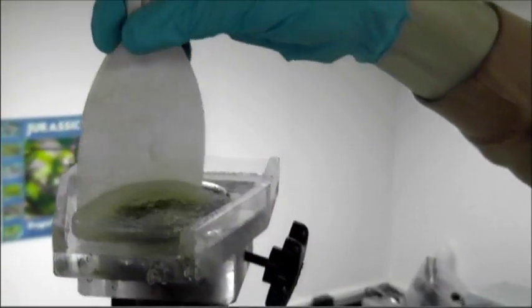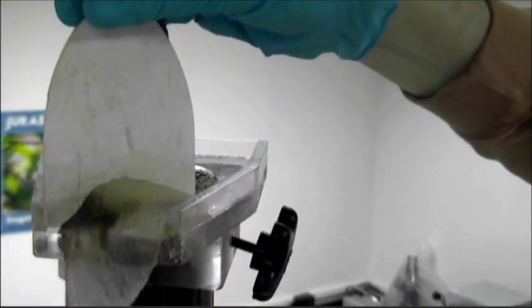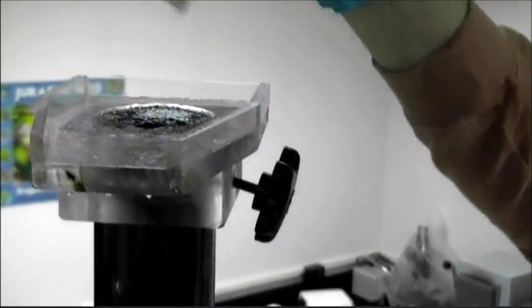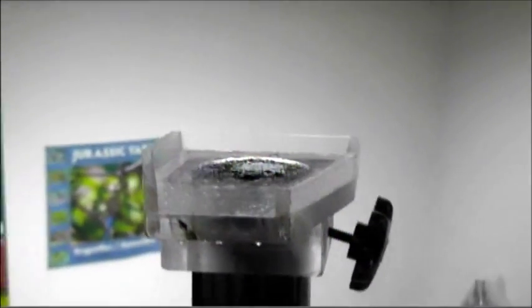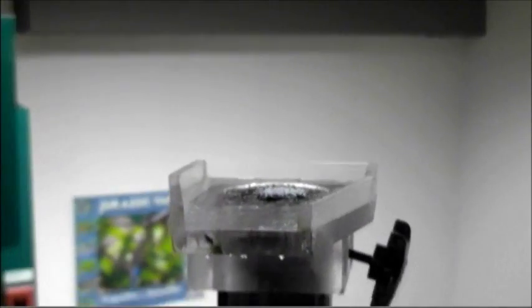Let's see how close we are now. We are basically there. So we are now at our surface and we can start extruding our sediment materials.